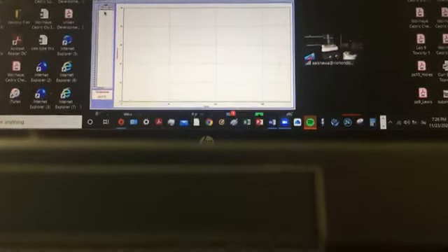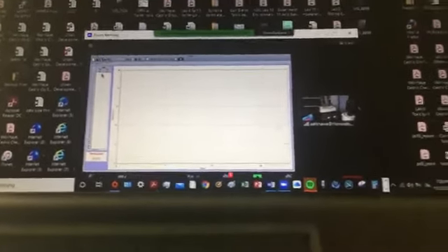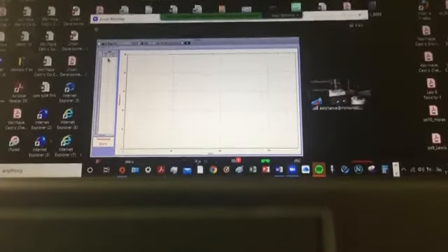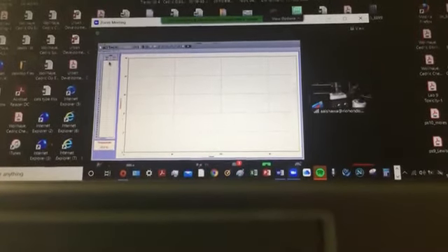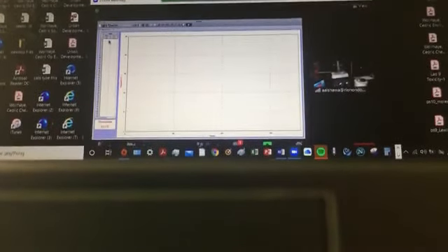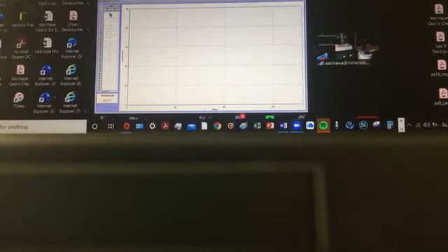Alright, so back to that page 99 or page 190, depending. Let's write down a few facts. The temperature of the hot metal, we're going to leave it alone until we're satisfied with the hottest temperature on that screen of the metal. So we're going to just leave it alone. But we can write down the initial temperature of the water inside the calorimeter.